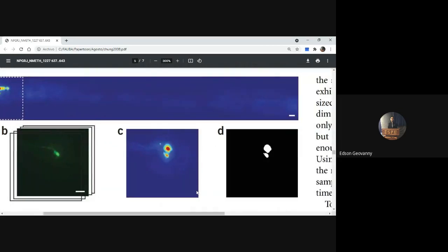And in this part, they determine if the worm had the wild type phenotype. The images were analyzed by flattening and thresholding. The worms were ordered according to their phenotypes.